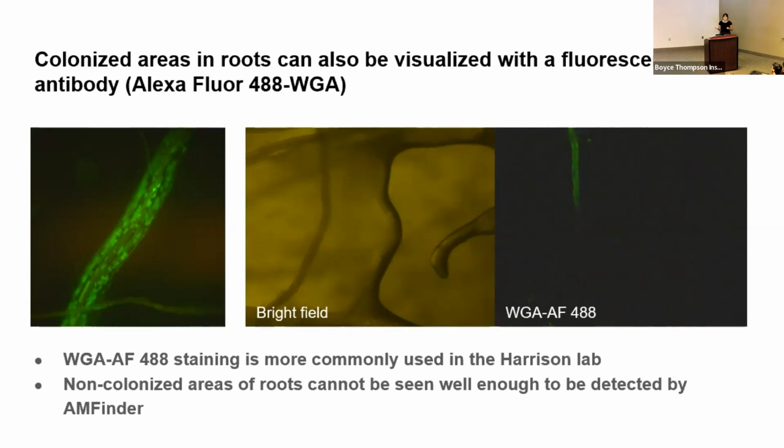We are also left with the problem of the field of view of the microscope being far too small for efficient imaging. Now, we haven't been able to solve this problem yet, but maybe there are different fluorescent scanners that we can use that we still have to try.